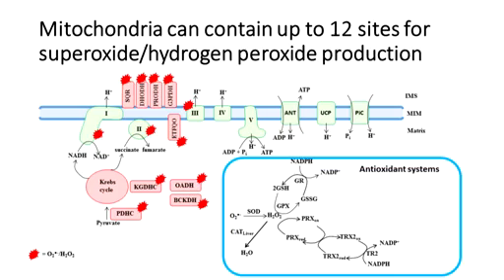mitochondrial dehydrogenases. This method is advantageous since it can allow for the direct and accurate quantification of the ROS-producing potential of individual sites of production by eliminating unwanted side reactions and any reactive oxygen species quenching systems.